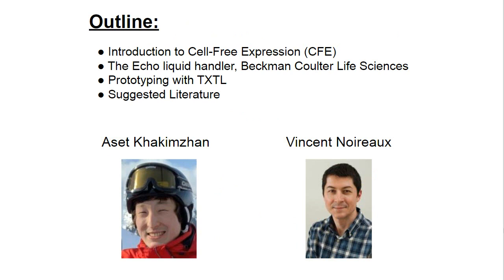In this webinar, we will cover the four following bullet points. First, I will introduce cell-free gene expression, a rather new technology to do some synthetic biology and bioengineering. I will then introduce the Echo liquid handler from Beckman Coulter Life Sciences. Aset will cover the third bullet point on prototyping with TXTL, and we will conclude this webinar with some suggested literature.